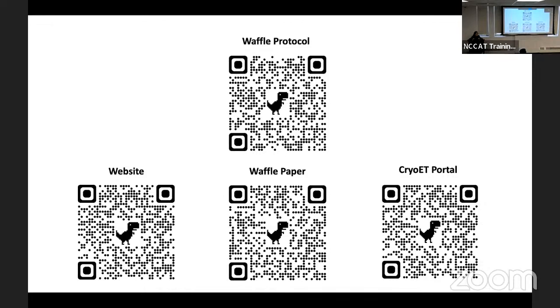Yeah, I'll have an image. Would a monolayer of, let's say, million cells be at the bottom, right? So you have to have a very flat lamella to even reach it, I guess. You could just adjust your angle. 20 degrees most likely will hit it. You could go higher if you wanted to. You just have to make sure that your cuts are longer so you can still capture the top. You just have to wiggle it around a bit and adjust the parameters. But you could also talk to Reza about specifically what he did, because I didn't do it, so I don't want to completely speak for that.